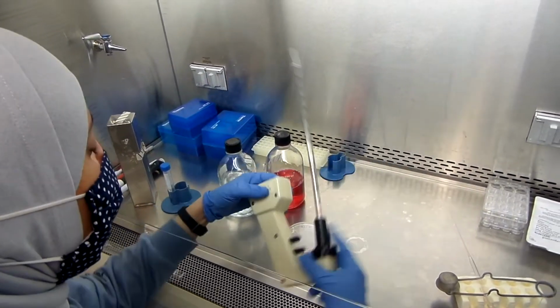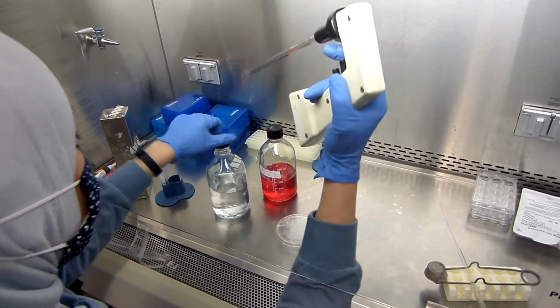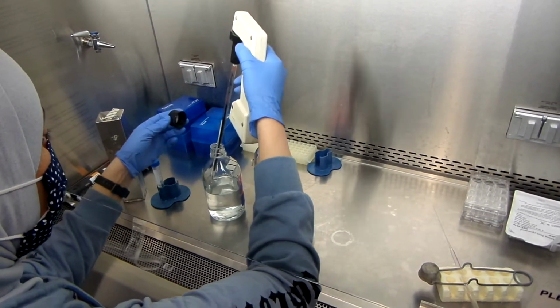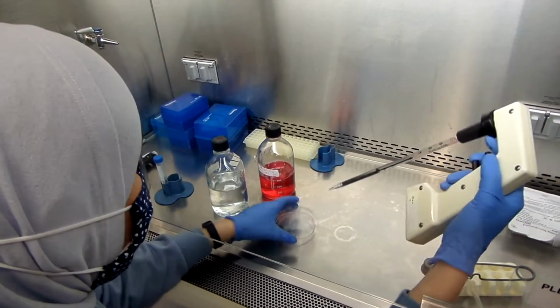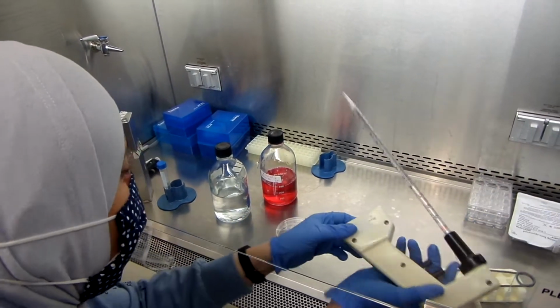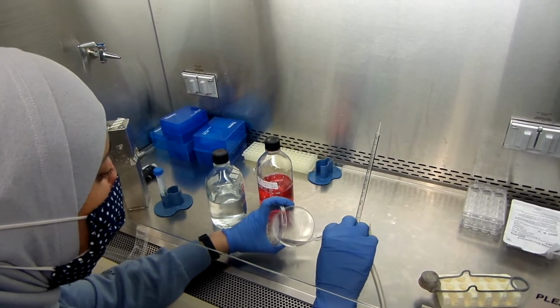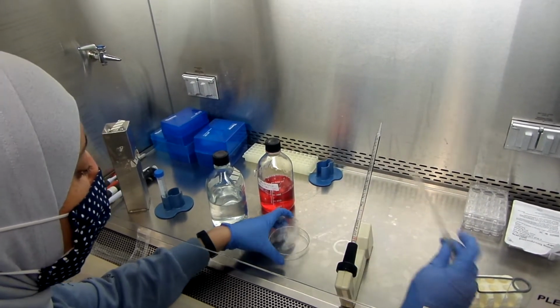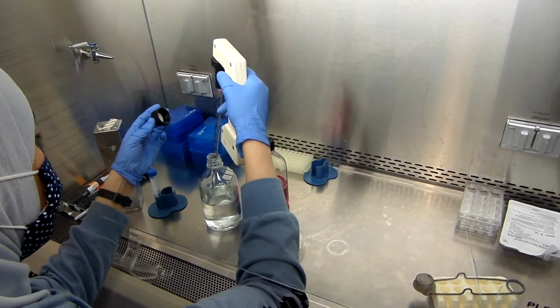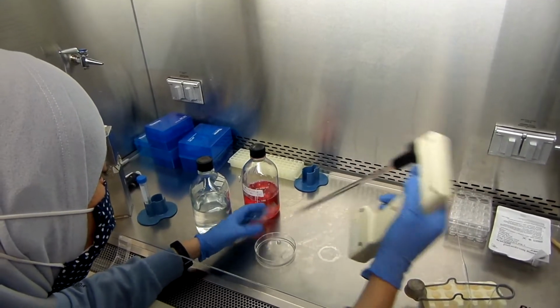I will wash twice with 6 ml PBS each time to get rid of the serum. The growth media has serum. Serum has all the growth factors needed for cell viability. So this is one time. This is the second time.